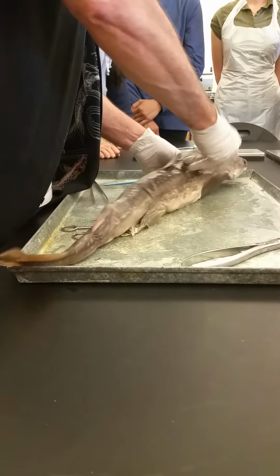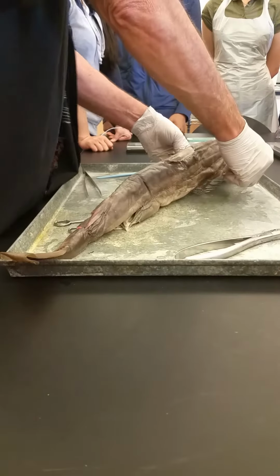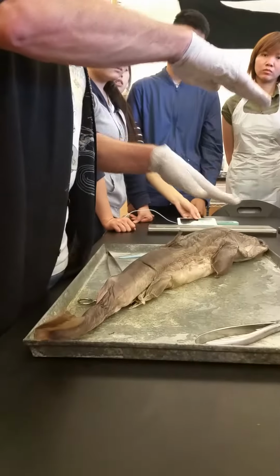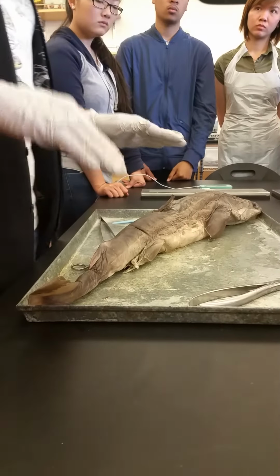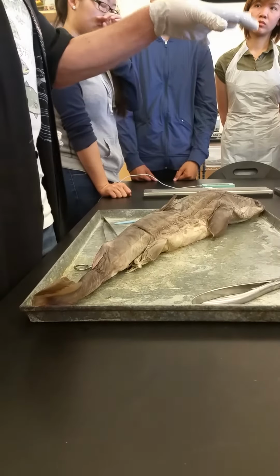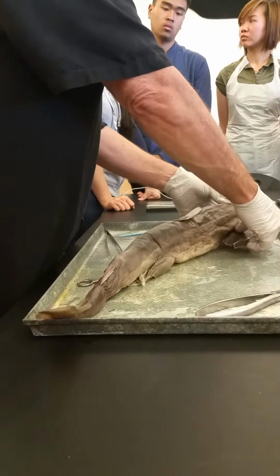That's why they need these rigid wings. So they don't have those ray fins. They have these rigid fins, but they're like wings. That gives them lift in the front. And so propulsion forward tends to nose down, the lift in the front, nose up, and they equalize out. The shark glides very effortlessly, like a glider through the water. And to watch a shark swim, the whole body is just this undulating, very smooth gliding through the water. It's a very beautiful motion to watch these things.